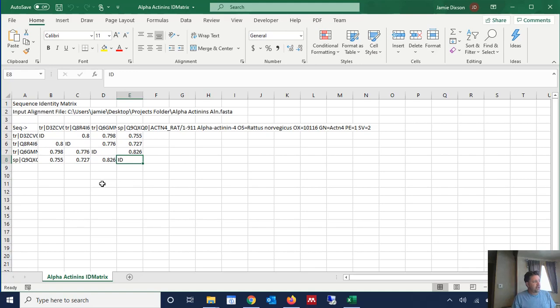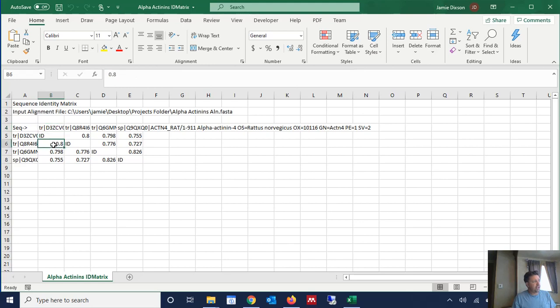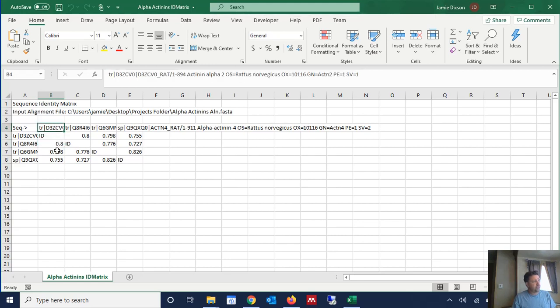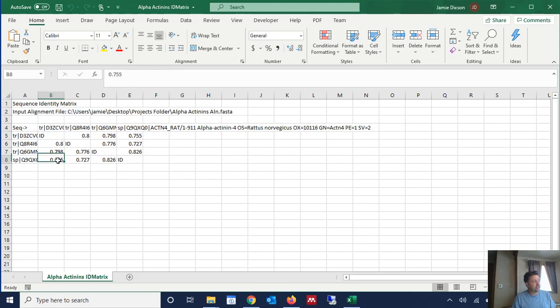But now we can see that sequence number 1 shows 80% identity to sequence number 2. Sequence number 1 shows 79.8% identity to sequence 3 and sequence number 1 shows 75.5% identity to sequence 4. So there's your identity matrix.